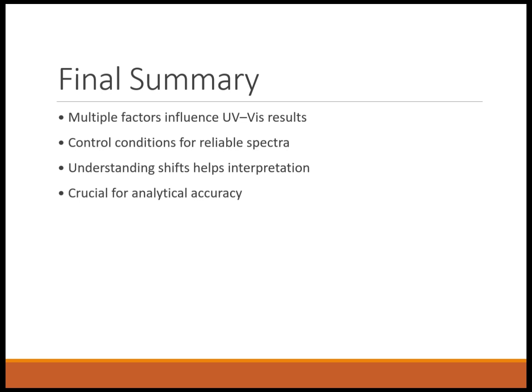In final, UV visible spectra are influenced by molecular structure, solvent environment, concentration, pH, temperature, path length, and instrumental settings. Controlling these parameters ensures accurate lambda max and absorbance values, leading to correct interpretation and reliable analytical results. A deep understanding of these factors is essential in research and industrial applications.